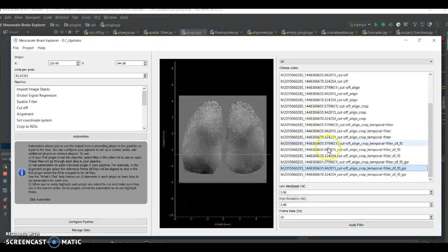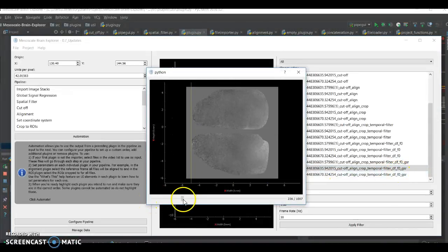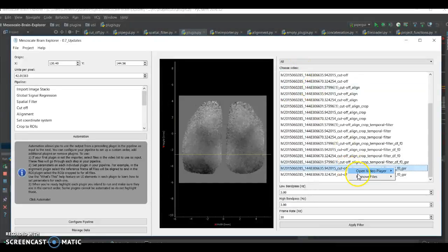What the second one is useful for is if your file is extremely large, say gigabytes large, then running the scaled one can take a considerable amount of time. In that case, if you click the unscaled one, it will load instantly, because it doesn't matter how large the file is. You're not loading the entire thing into memory, so it'll just look at the first frame from there. But the scaled one is, of course, what you need if you actually want to look at what it actually looks like. If you just want to take a quick peek, you have the unscaled version.